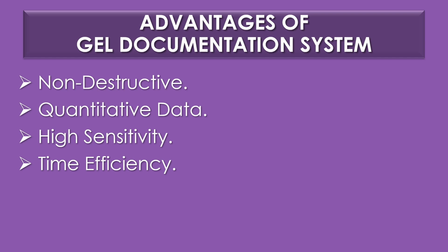The third advantage is high sensitivity. Gel doc systems can detect very small amounts of DNA, RNA or proteins when fluorescent or chemiluminescent stains are used. The fourth and final advantage is time efficiency. The gel documentation system provides quality and efficient documentation compared to manual methods like photography.